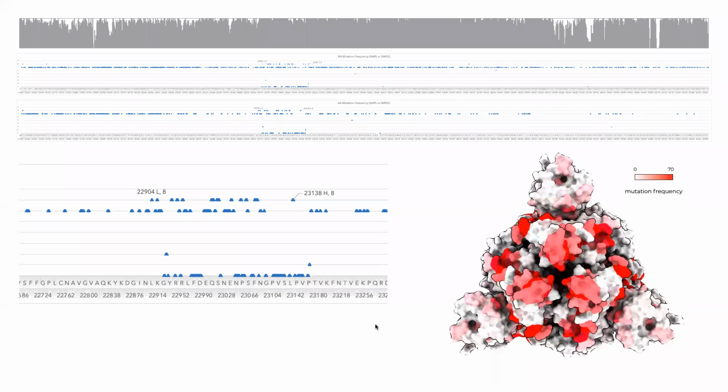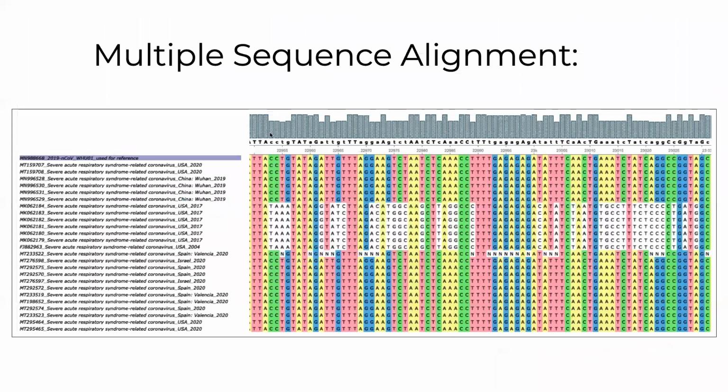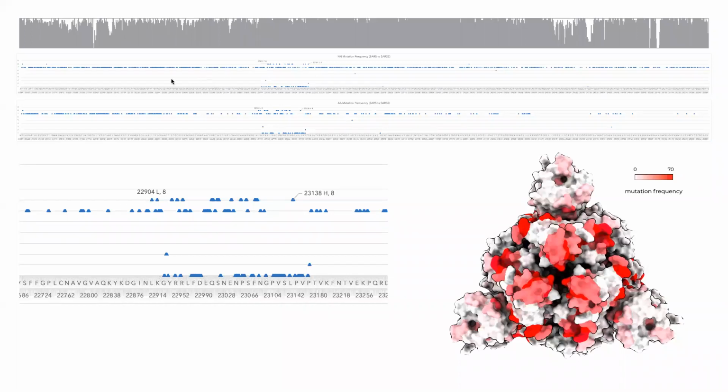What kind of graph or map is this called? Again, this is multiple sequence alignment. This is the quality of consensus sequence, based on Clustal multiple sequence alignment. And here you have mutation frequency at the nucleotide level, and this is mutation frequency at the amino acid level. And this is the transposing of that onto a 3D structure from the PDB file 6VXX, which also shows mutation frequency. We'll talk about all of these things in greater detail in some of our future sessions.